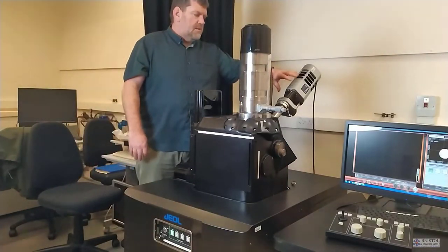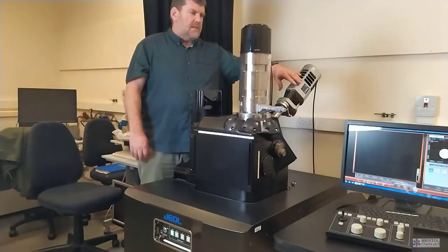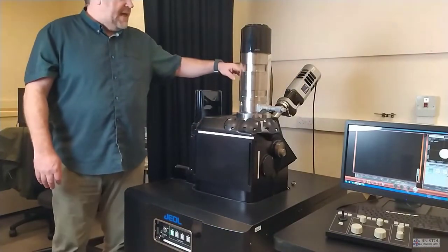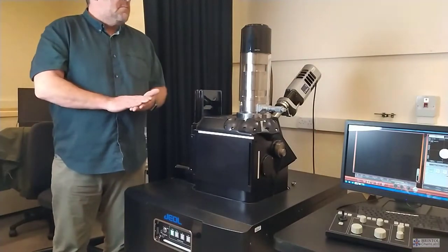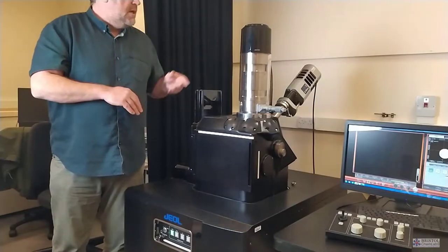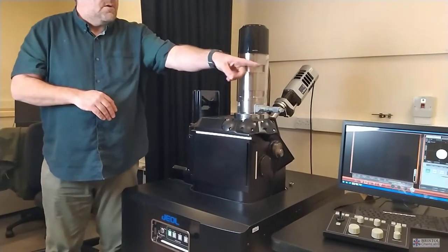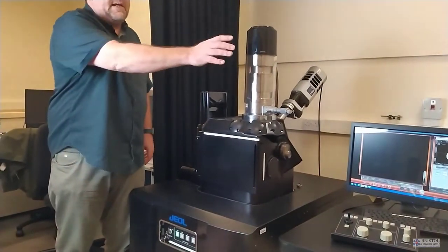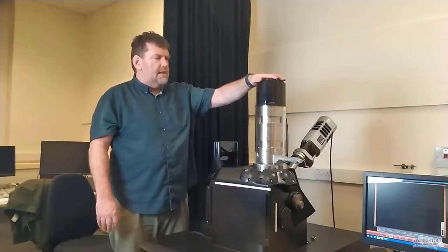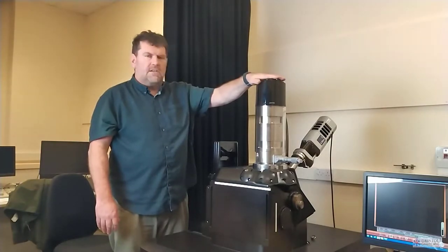This is the x-ray detector. The silver bit hanging off the side is collecting the x-rays that are being produced from the interaction of the electrons with the sample, and all that information is then analyzed on a separate computer. At the top of the microscope we have what's called an electron gun.